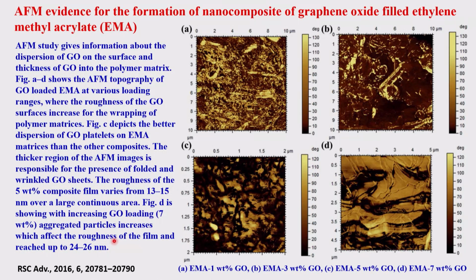So I hope you understand this example of the 4 levels of loading and the corresponding results. Nice, very uniform distributions and very optimal levels of roughness, everything is quite well, but beyond that and below that, it is not very good.